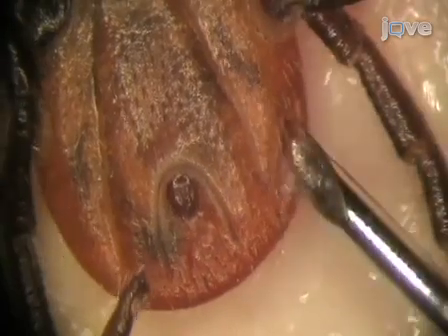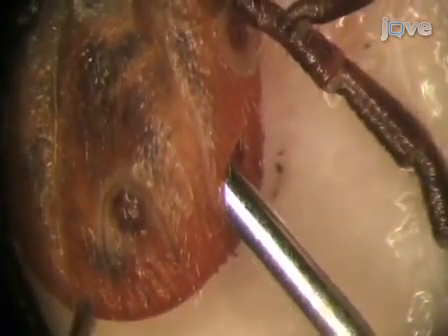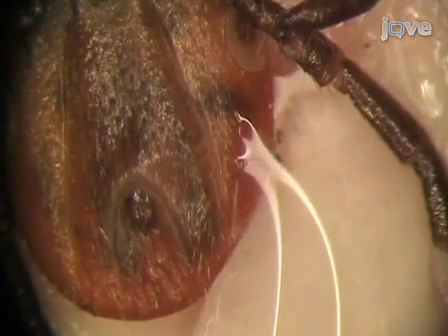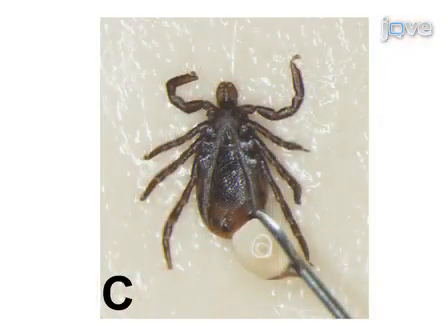Place the needle well into the tick cavity to ensure the placement and retention of the double-stranded RNA. Even though fluid is released after injection, deep placement of the needle for injection will ensure that sufficient double-stranded RNA is deposited into the tick cavity to cause gene silencing. Care should be taken not to over-inject the ticks, which will cause loss of hemolymph and death of the tick.